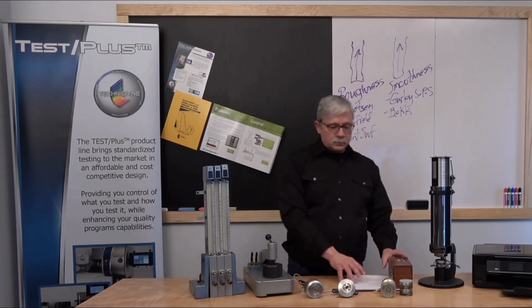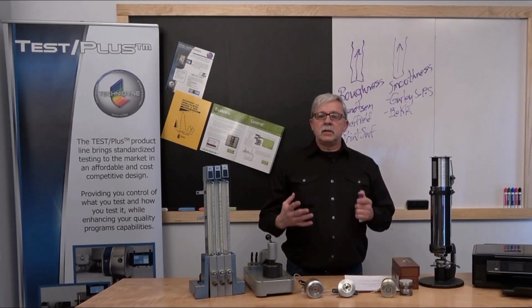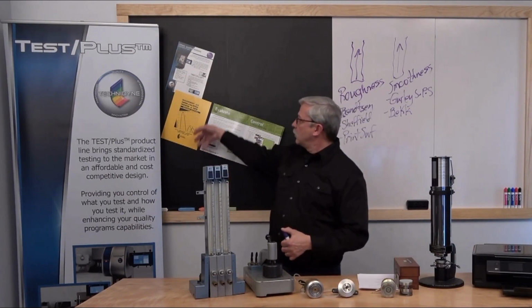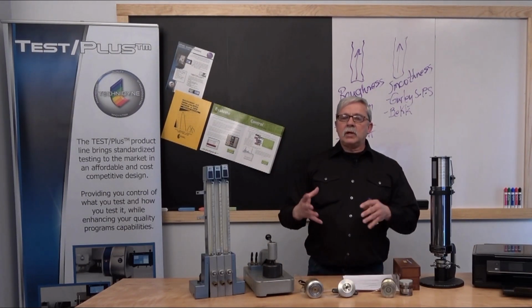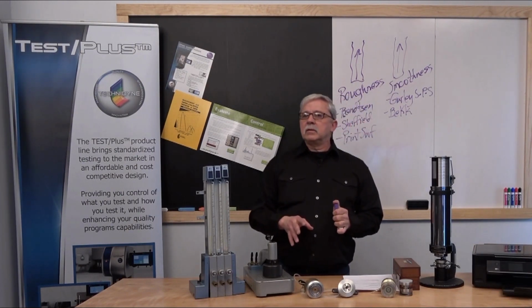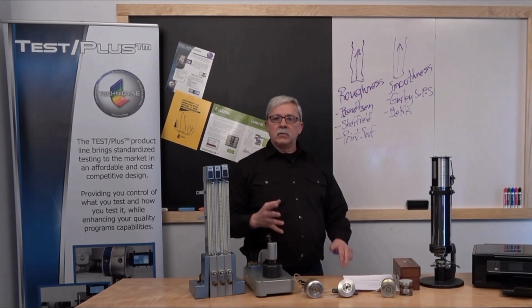With that, I want to talk to you a little bit about what this particular characteristic is that we are measuring. We look at a particular product: you have a printout, a brochure, some signage. What we're looking to do is quantify, and this goes back a lot of years, this test had a very good correlation with printability. So we want to be able to quantify what the surface of the product we're testing really looks like.